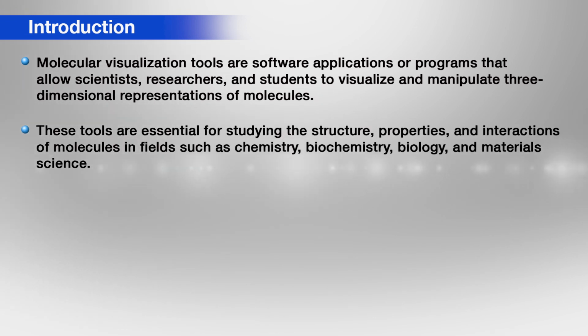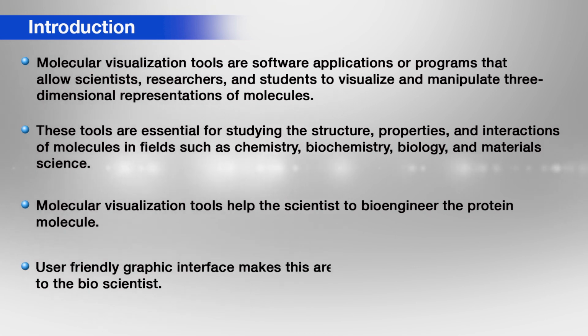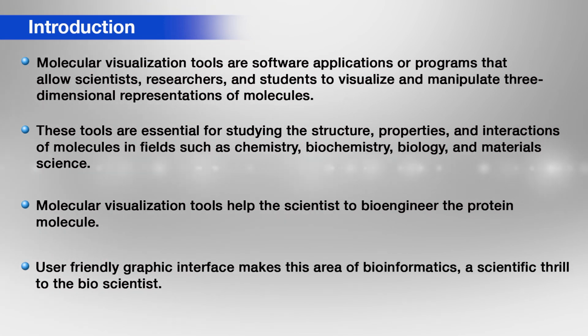These tools are essential for studying the structure, properties and interaction of molecules in fields such as chemistry, biochemistry, biology and material science. Molecular visualization tools help scientists to bioengineer protein molecules. A user-friendly graphics interface makes this area of bioinformatics a scientific thrill to bioscientists.